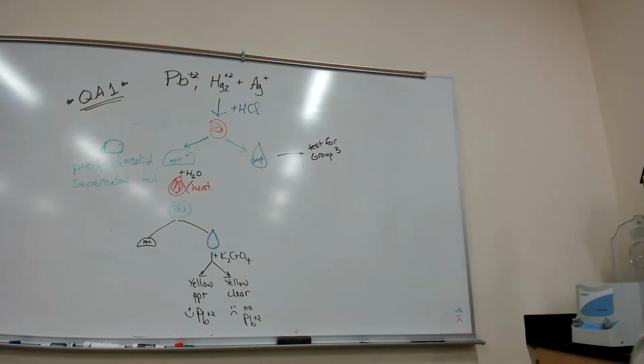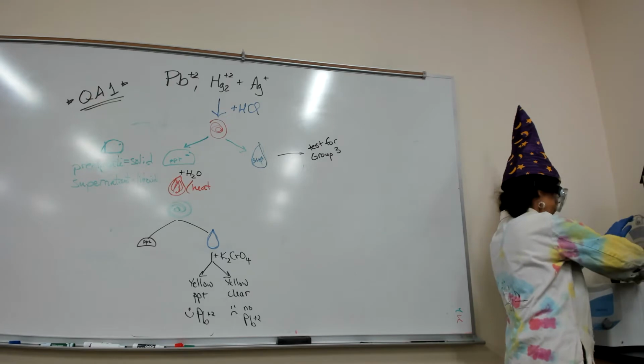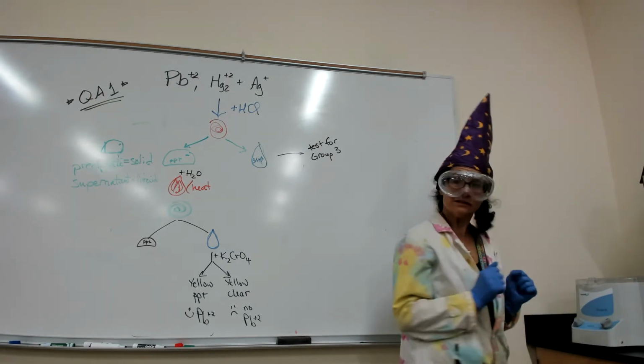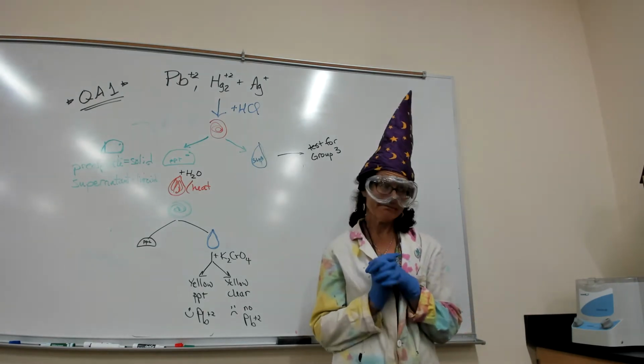All right, so we're gonna take this out of our hot water. I know I'm off screen because I'm burning my fingers. Easy bake oven. Count. Sing the alphabet backwards.